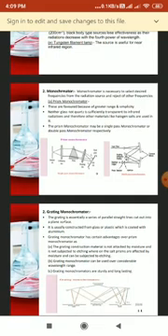Now we have seen the double pass monochromator. In the double pass monochromator, there occurs a total of 4 passes of radiation through the prism, as compared to the single pass monochromator. The double pass monochromator produces more resolution of radiation than the single pass monochromator.